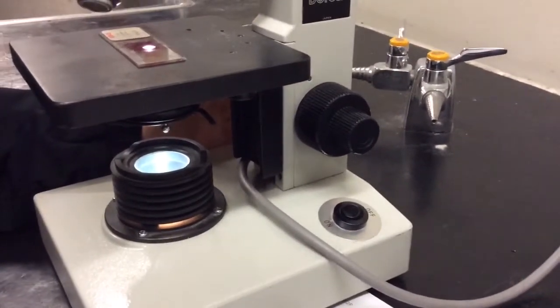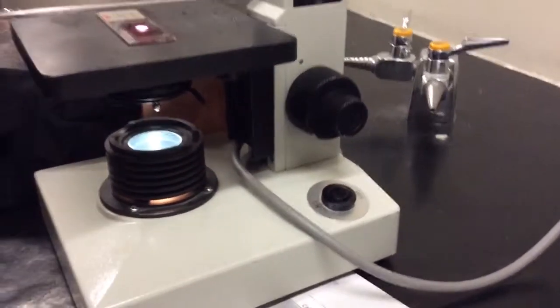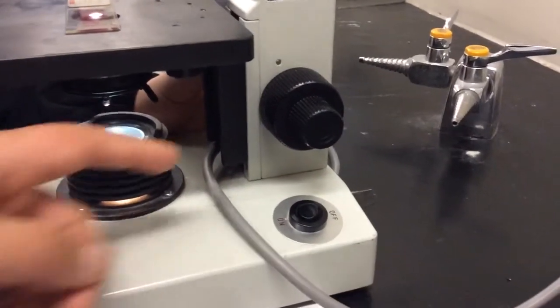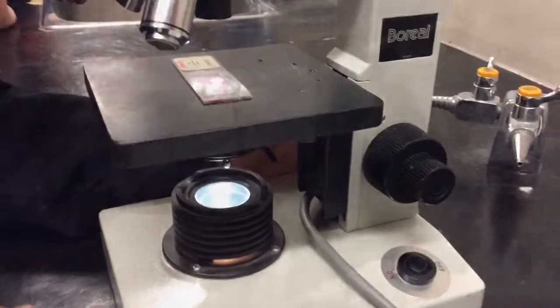Science. Where is your fine adjustment knob versus your coarse adjustment knob? It's your fine adjustment knob, and where's your coarse adjustment knob? I like it. Nicely done.